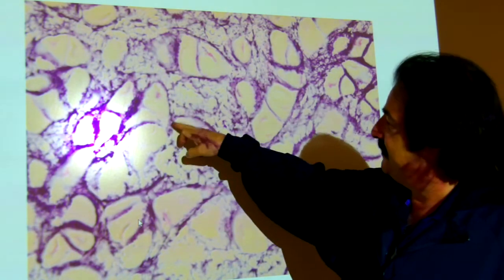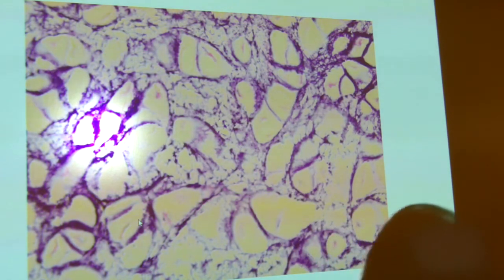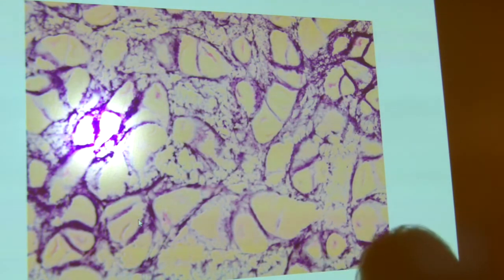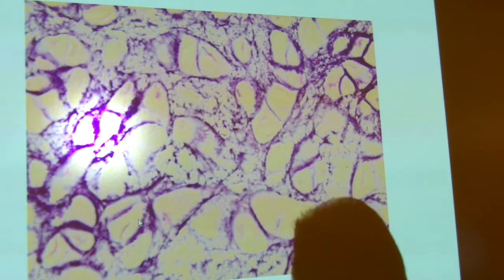These elastin fibers right here are really good for bending. If you look in your book, it says that elastic cartilage is found in the ear, the outer part of your ear. That's why you can flip it around and move it pretty much.